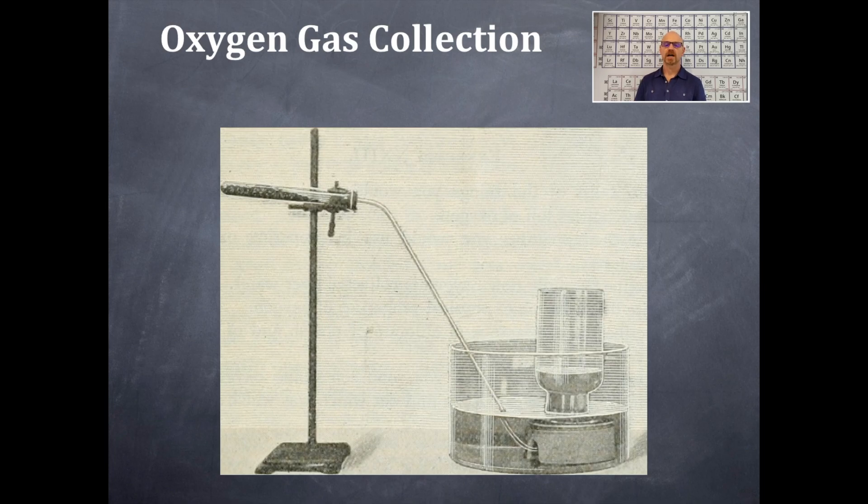This time we're going to put potassium chlorate in here, heat this up, and then oxygen gas is generated here. This is also done by water displacement of the gas. All right, that's number two.